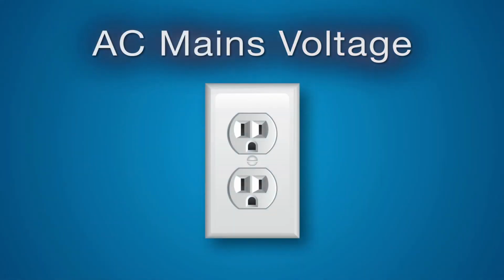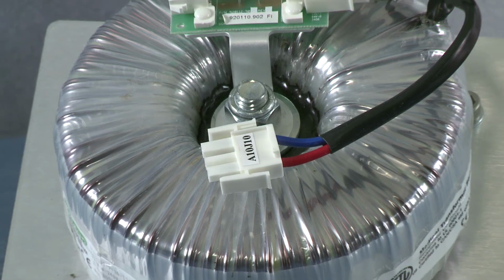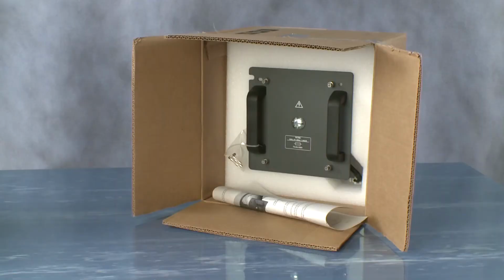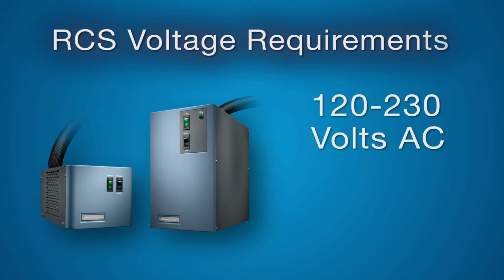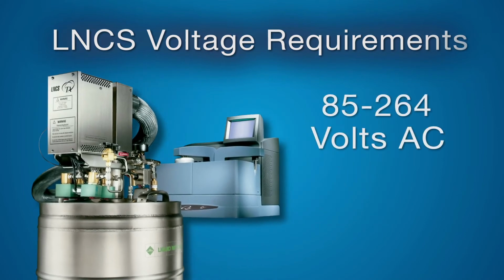The Q Series DSC can operate on 120 or 230 volts AC. For 230 volt operation, a transformer kit is required. It is normally included in shipment to 230 volt regions. The RCS 40 and RCS 90 can operate on 120 or 230 volts AC. The LNCS can operate on 85 to 264 volts AC.